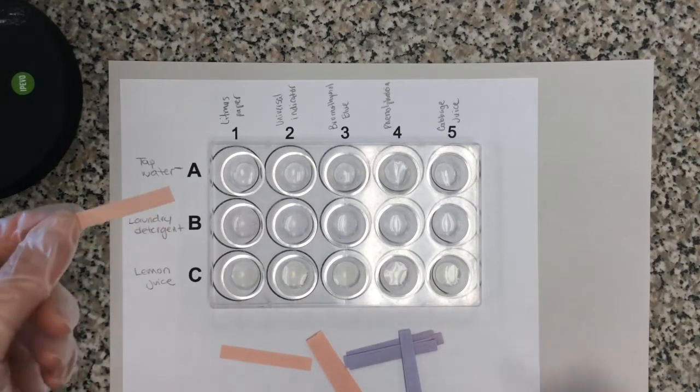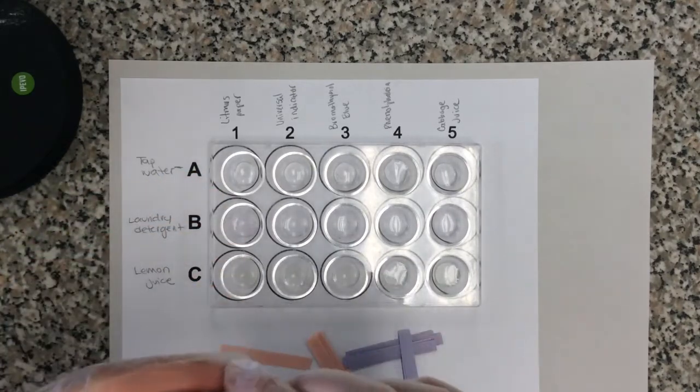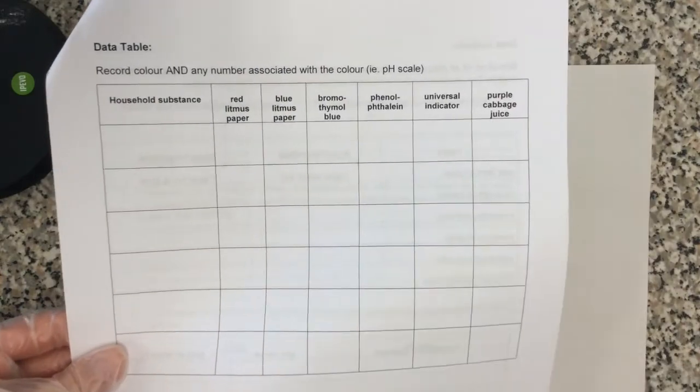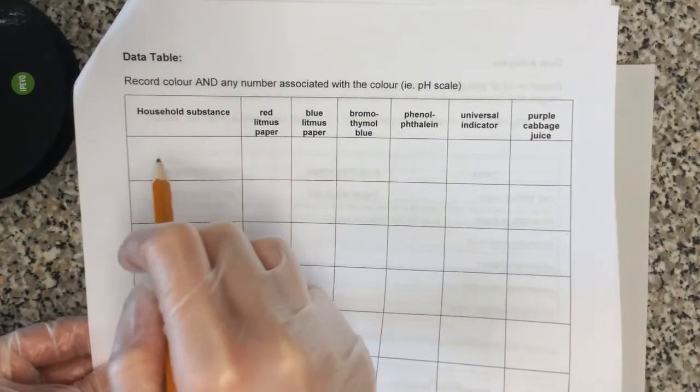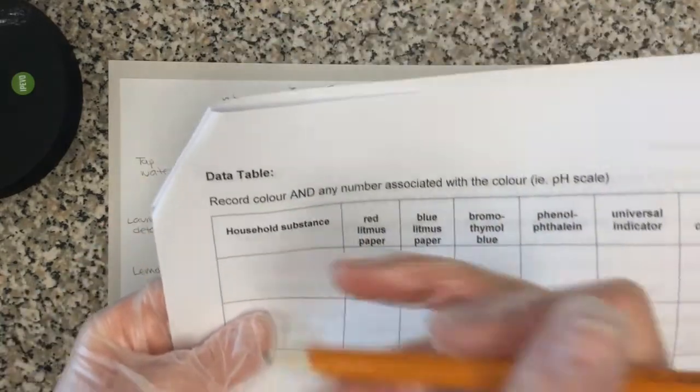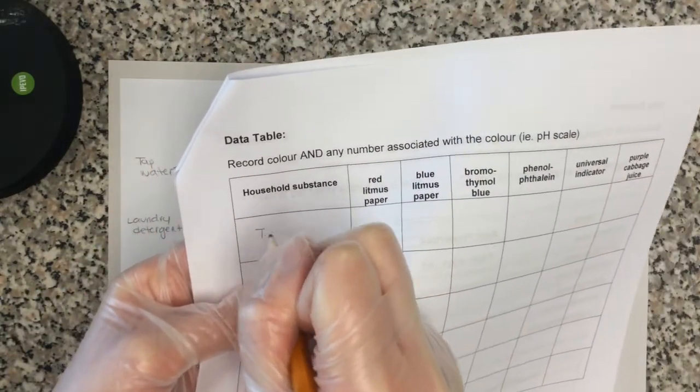Okay, so I have my red litmus paper. And while I do this, it's important that you record your results in your lab. Right here, we should be writing what substance I am testing. So we are going to be testing tap water. Let's go ahead and write that in.